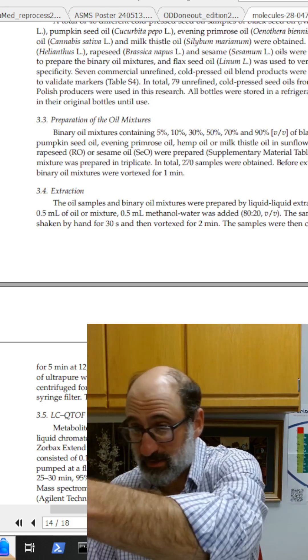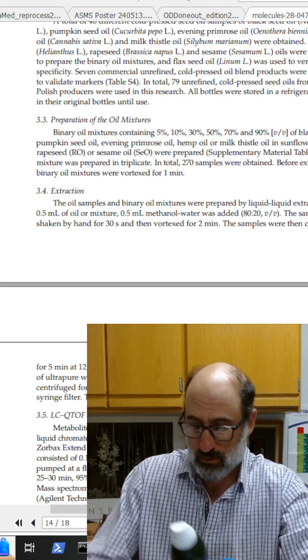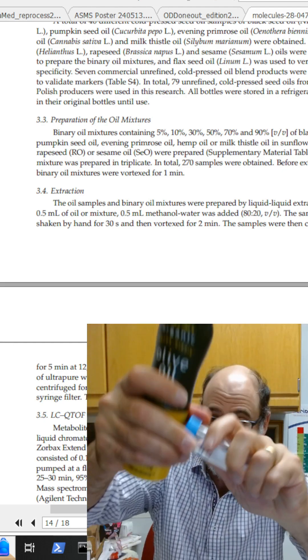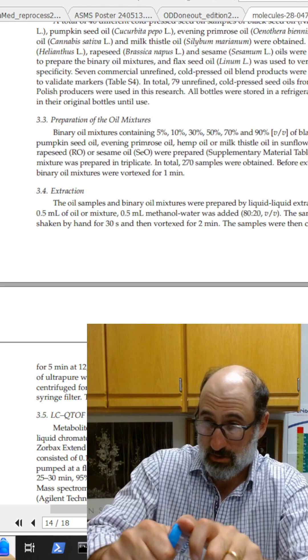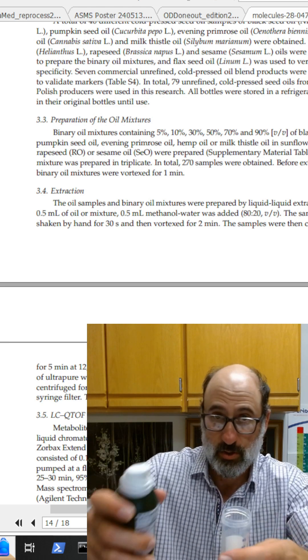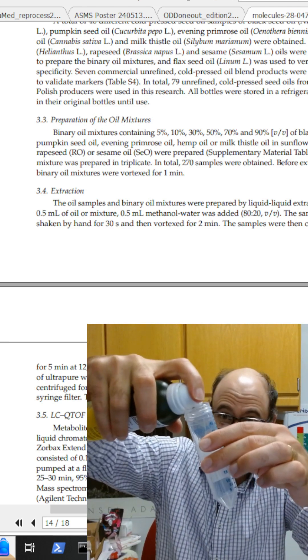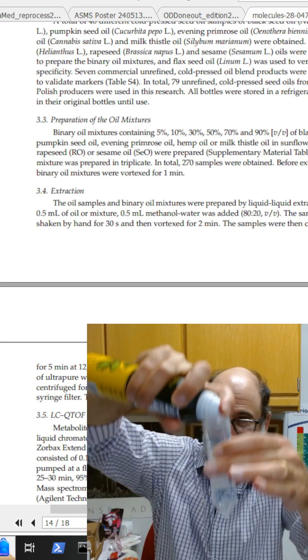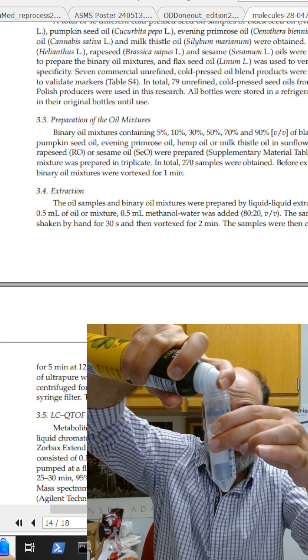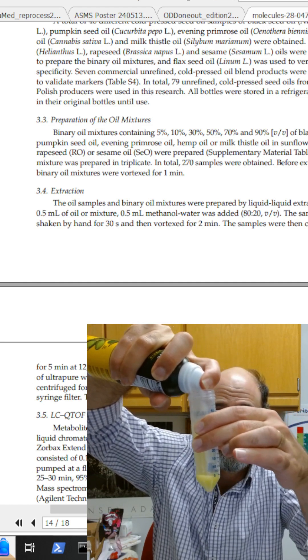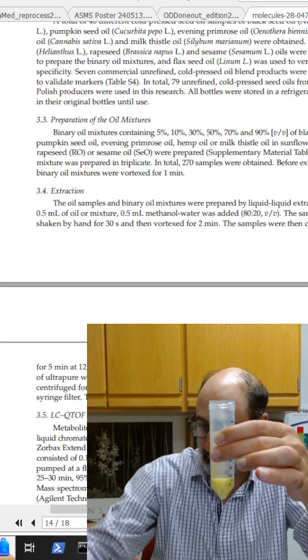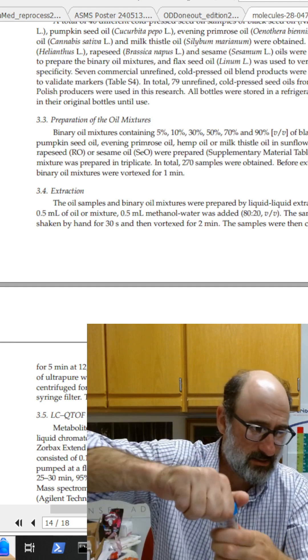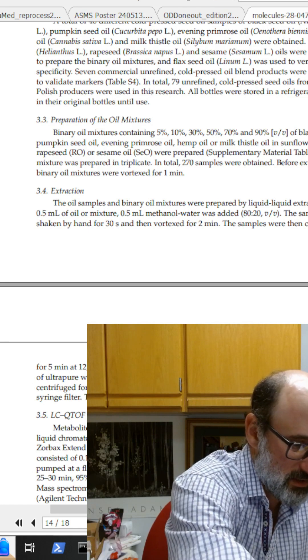So I'm going to try to do this on camera, not on my phone. Hopefully I don't get it all over my desk. This is the Trader Joe's No Propellant Olive Oil Spray. Beautiful, that's enough. This is the olive oil.